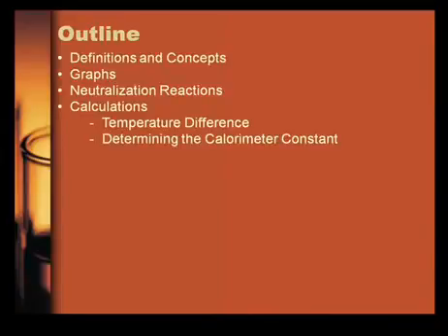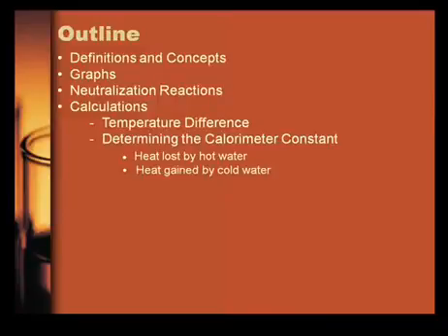calorimeter constant, which would include heat lost by hot water, heat gained by cold water, and finally using these two bits of information to calculate the calorimeter constant.